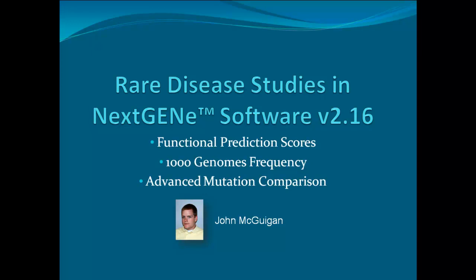This webinar will cover rare disease studies using new features introduced in NextGENE version 2.16. This includes functional prediction scores, 1,000 genomes frequency, and advanced mutation comparison using the variant comparison tool.